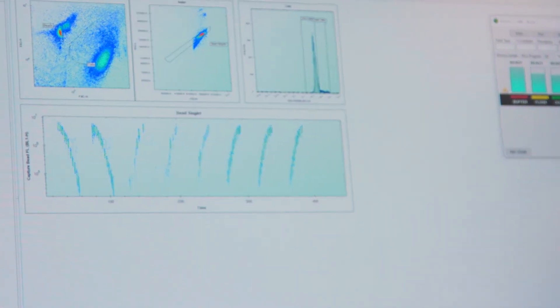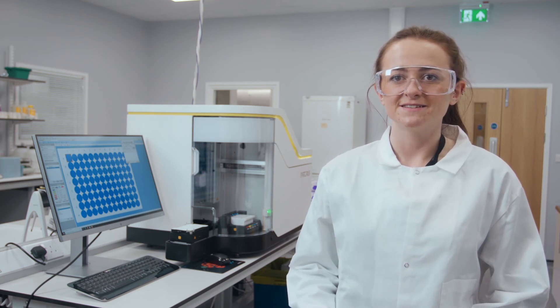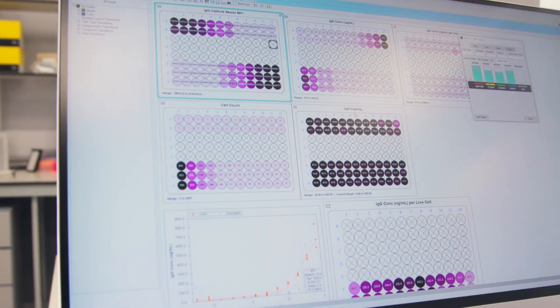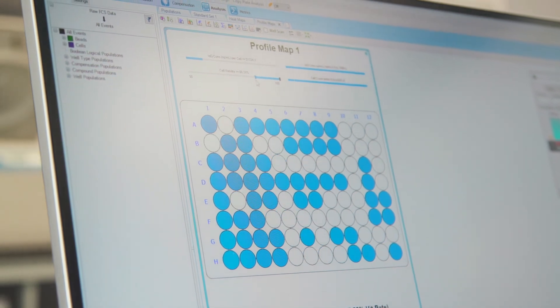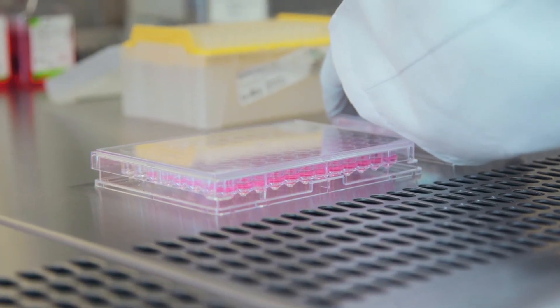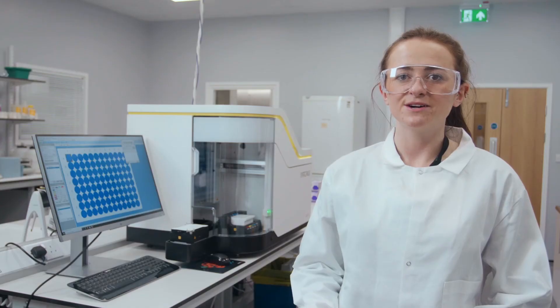While the IQ3 is acquiring, the template is then populated with the data in real time. As we move across the tabs, we can see the type and titer automatically pulls through data and we can see our cell population and viability status. Metrics such as IgG per viable cell can then be represented using heat maps so the individual wells can be assessed easily by eye. Profile maps with user defined criteria can also be made to quickly single out clones that have the desired characteristics. The panorama feature can also be used to graph multiple criteria at the same time to allow users to rank the clones in order of the highest producers.